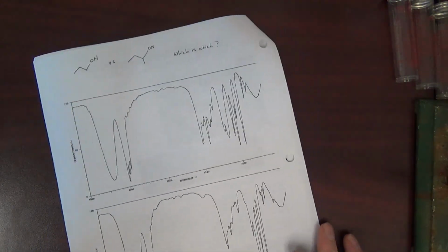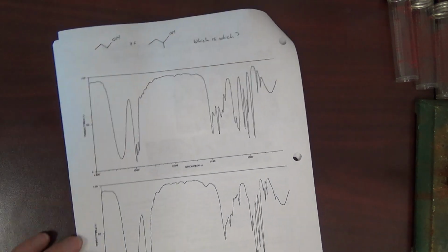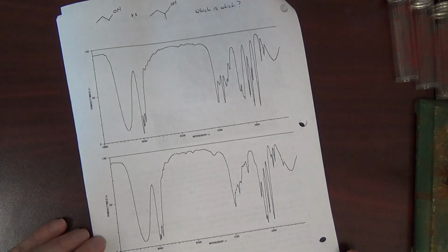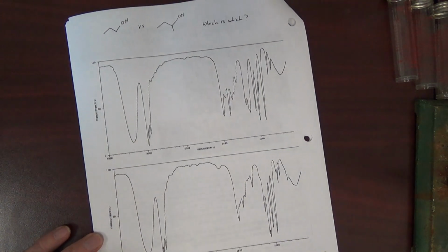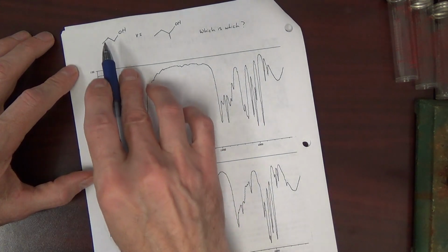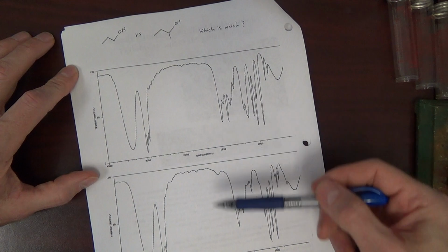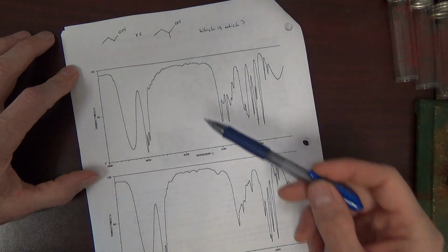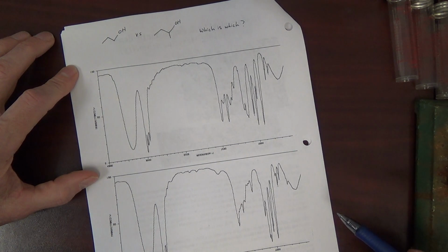Let's start by looking at IRs. And we really want to point out the limitation of IRs. Take a look at these two alcohols. Very similar structure. Can you assign each alcohol to its IR? Which IR belongs to which alcohol? It's actually nearly impossible to tell.